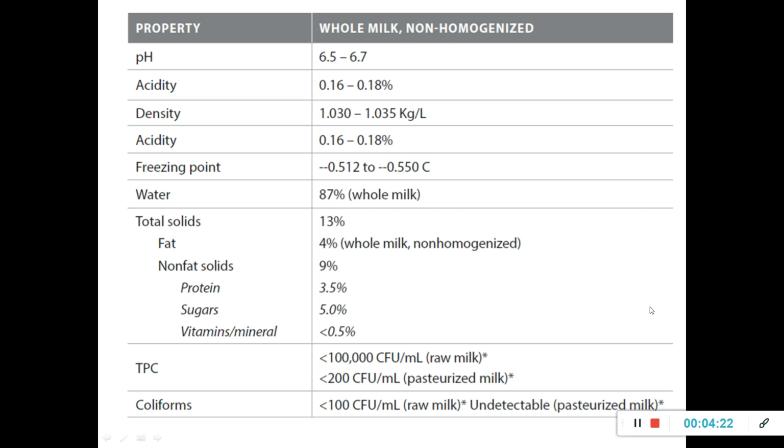milk. Now, these chemical parameters which we consider here give us first-hand knowledge of whether the milk quality is being altered. In addition to this, the total plate count method and the coliform test can be used to check the microbiological quality of the milk.